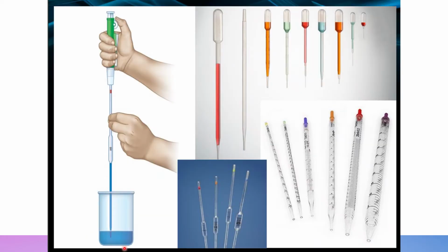Let's go back to this diagram here, class. So when using either the pipettes, the tip must be immersed in the intended transfer liquid to a level that will allow the tip to remain in solution after the volume of liquid has entered the pipette. So this is what it looks like. And make sure that you do not touch the vessel wall. So either here, here, or below. Make sure you don't touch those.